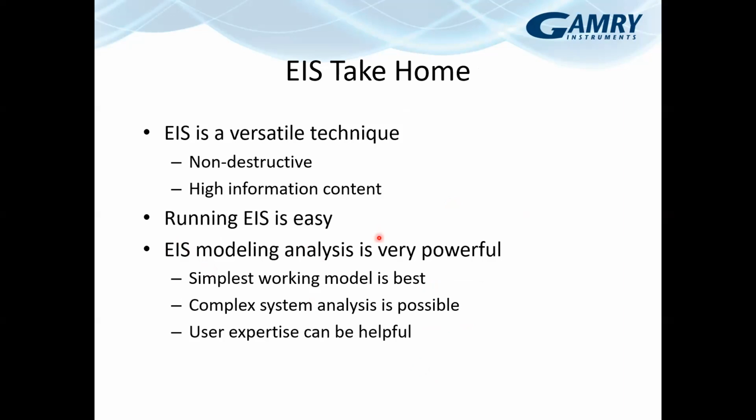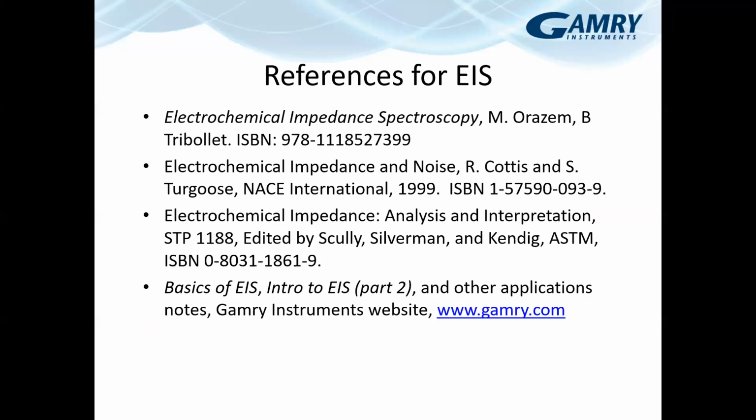EIS modeling analysis is very powerful, but a few things to note. Use the simplest working model. This is going to generally be the best until you have more information that you can put into something. Complex system analysis, however, is very possible, and user expertise can be quite helpful. And with that, here's a list of references.